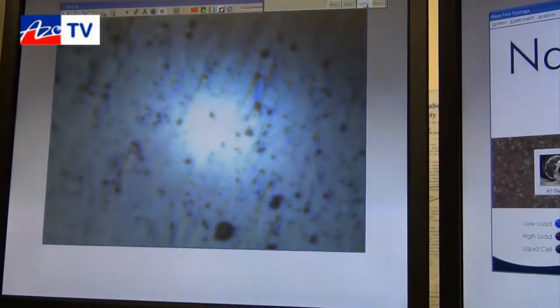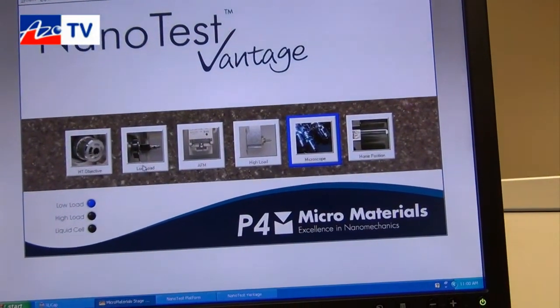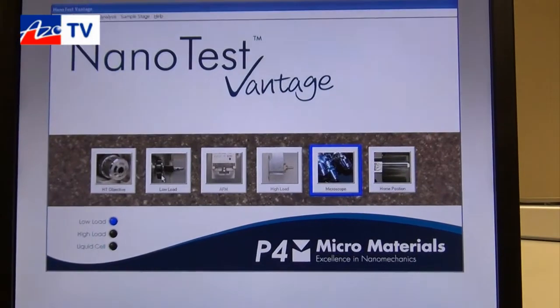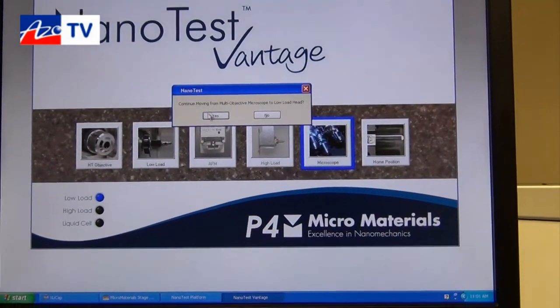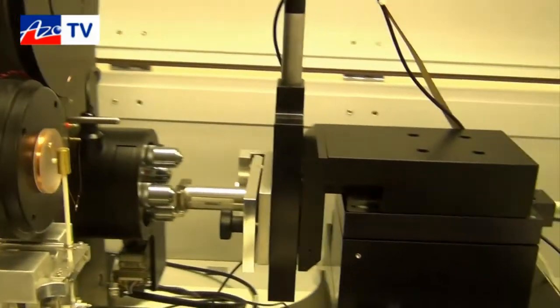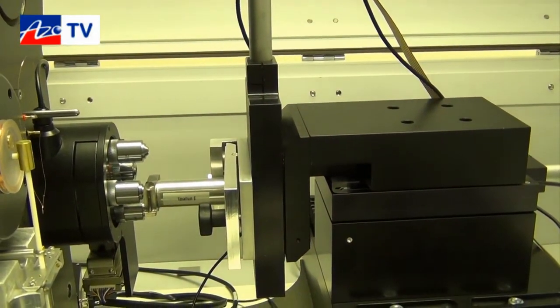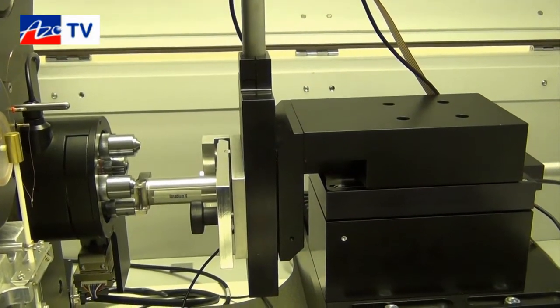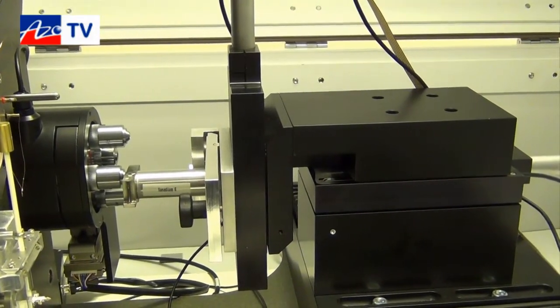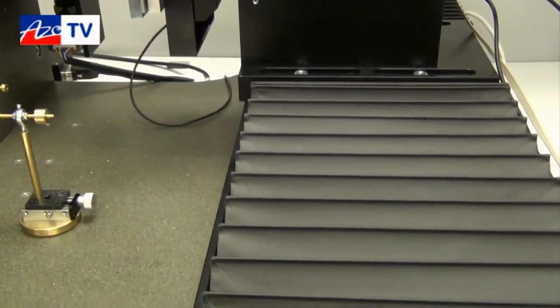And apart from the easier to use nature of this instrument, what are the upgrades you've got for this instrument compared to the previous generation? We've changed the entire base of the instrument. We've moved to a very stiff, high rigidity granite platform which brightens up the instrument but also adds benefits in terms of the stability and the compliance of the entire instrument. We have changed the stage positioning motors and stages to increase the accuracy, and this allows you to target specific structures in your sample with far more precision.